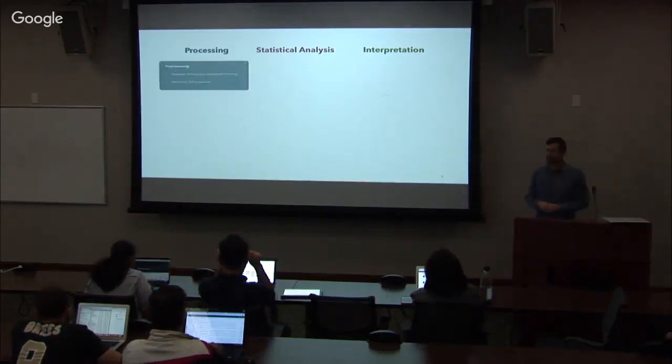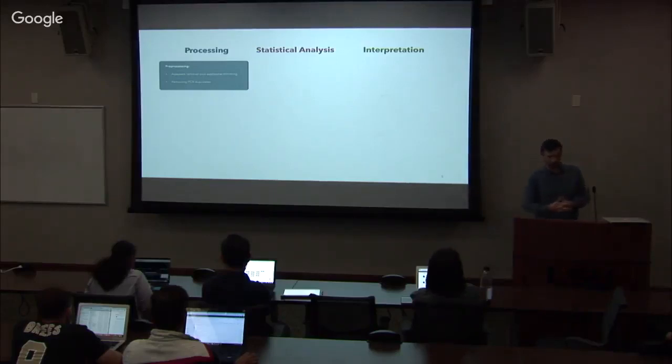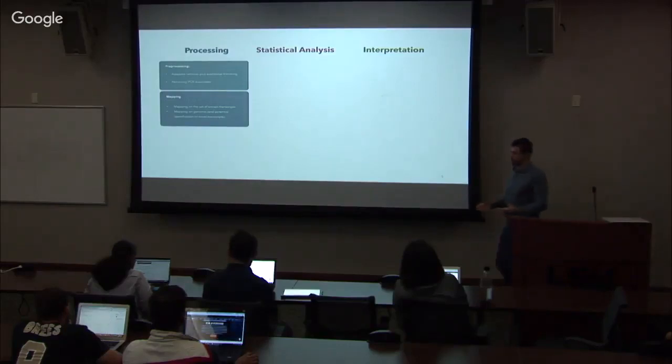And this is done in several steps. So each one could be divided broadly. This is a very broad kind of overview of what we will be doing. Pre-processing. So how do we eliminate technical variation that we don't want to include in our analysis? And how do we map the raw reads that we have on what?